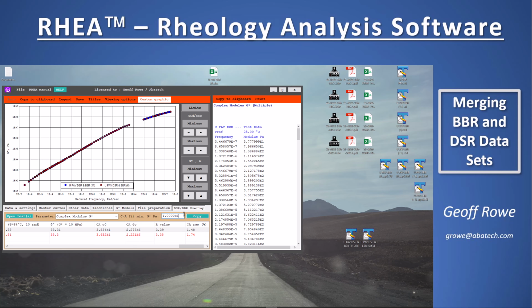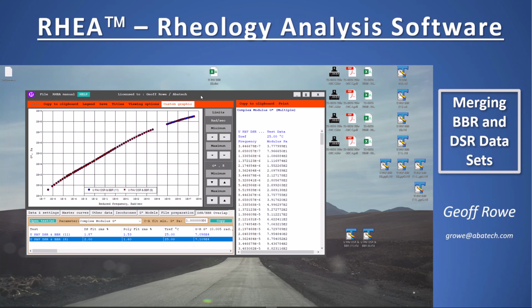If I change that limit to, say, 1e to the 6, so we cut off all the lower part of the data, which is normally what I like to do, you can see we've got 3.4 versus 3.38. So these data sets are very similar. You get slightly better results if you export the data to 11 points versus keeping this data as 6 points, which you get in the automatic analysis.